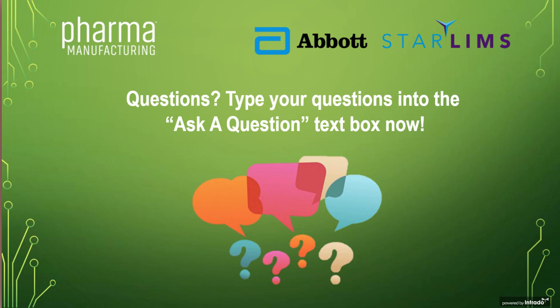Okay, perfect. Another question for either of you. An attendee is asking, is the mobile environment designed for data capture, or is this for reviewing for convenience? Also, where can I find a list of the functionalities available in the mobile interface? I can answer that one. This is Janet. It's designed so that you can design it the way it suits best your organization, because as I mentioned, you can create your own mobile app. But today we have mobile applications, let's say for logging a folder, a sample.